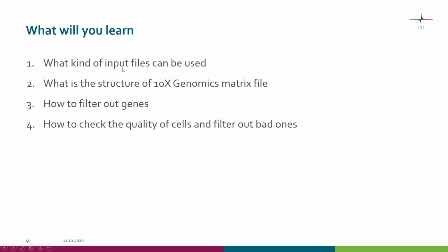So what will you learn during this video? Well, after listening to this video, you should know what kind of input files can be used, what is the structure of the 10x genomics matrix file, how to filter out genes, and how to check the quality of cells and filter out bad ones.